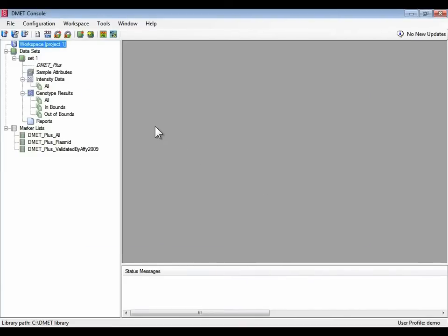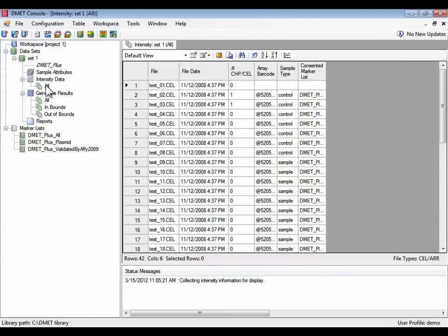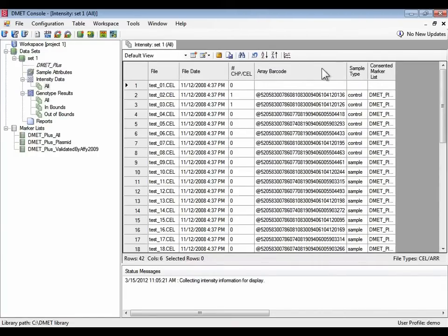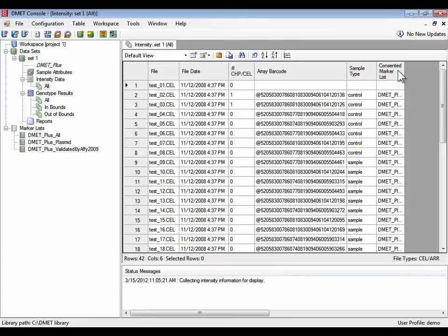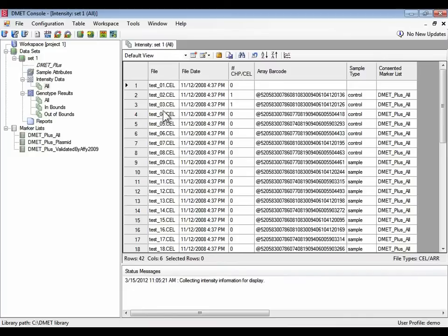There's a number of ways to initiate genotyping. First, let's look at all the cell files we have. Double click these columns to auto space them. All right, so each of these rows represents a different cell file. There are 42 rows or sample or cell files that we have.